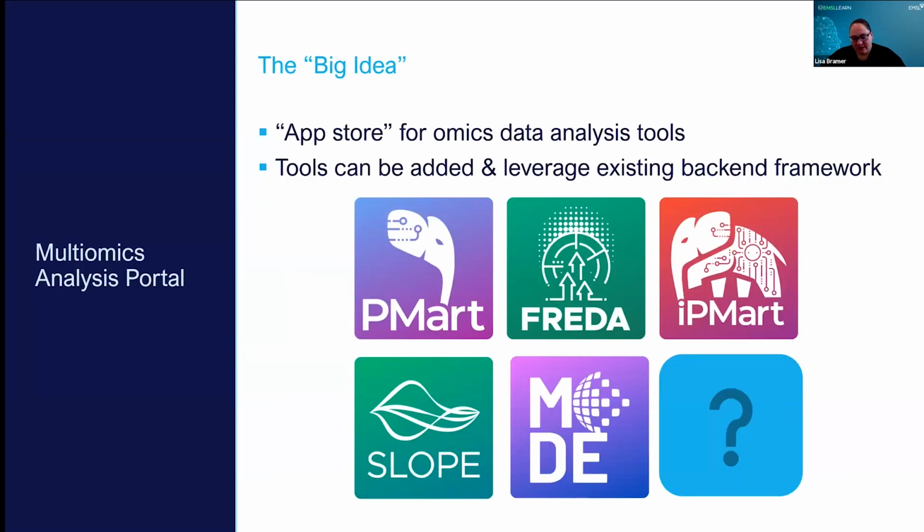the big idea here is that rather than trying to build one giant application that handles every type of data, every experimental design, every type of analysis, we built the Multiomics Analysis Portal, or MAP, and it's designed to be more like an app store, like you would have on your phone, right?